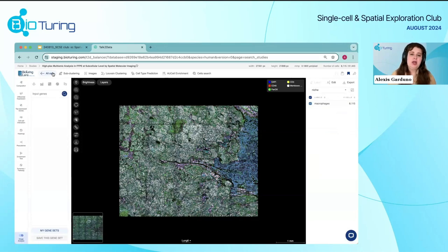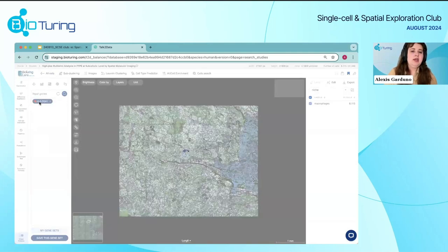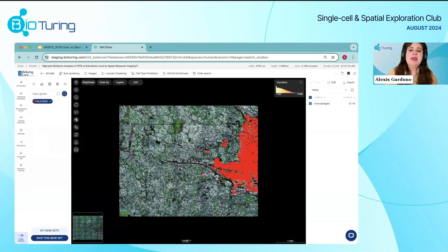And from here, we're going to try to identify both the positive or highly enriched HLA-DQA1 transcript expressed cells and also the SPP1. So in order to do this, I'll search for that specific transcript, A1. Okay, I'll click on the expression. So in order to capture all of the different cells that are expressing that transcript, instead of gating only a level or normalized level of that expression, what we're going to do is change the unit from a normalized to a binary unit. So I want to really capture all those cells that are expressing that transcript at some level.